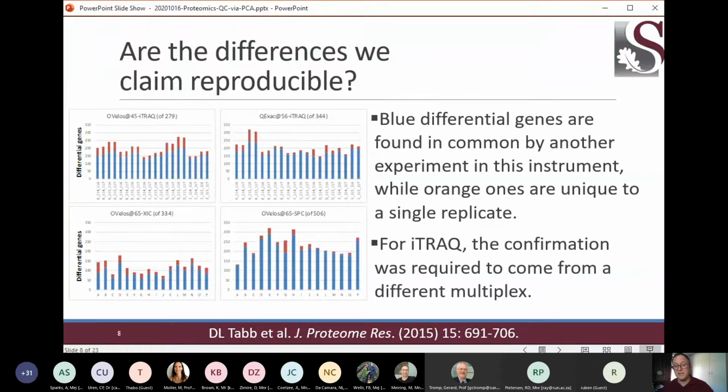So generally speaking, I think we can say that so long as you're pretty careful in the statistical framework you use to decide which proteins are differential, the differences you claim are reproducible if you were to repeat that experiment. That was something a lot of people had a lot of doubts about as we began the CPTAC project. So I was really grateful that we could shed some light on this kind of problematic concern. We've heard far too many people say proteomics is just not reproducible. And this was evidence that in fact it is. But you do have to be quite careful in your statistics.